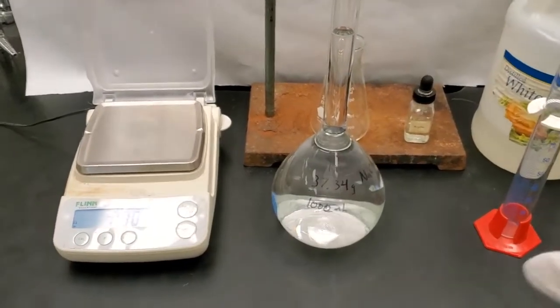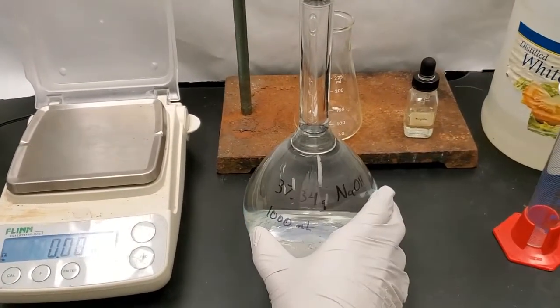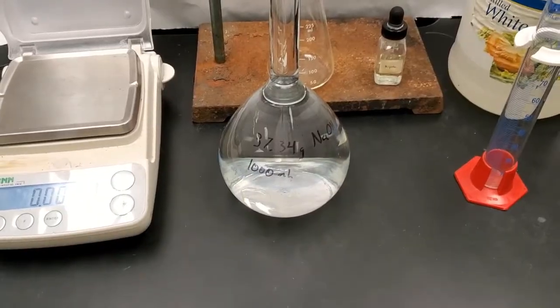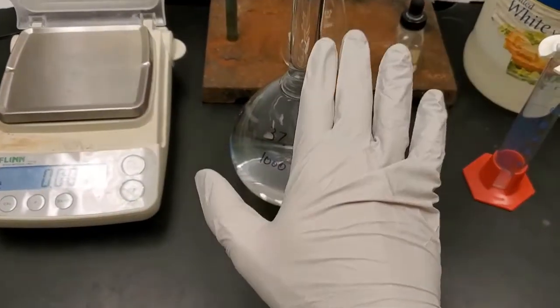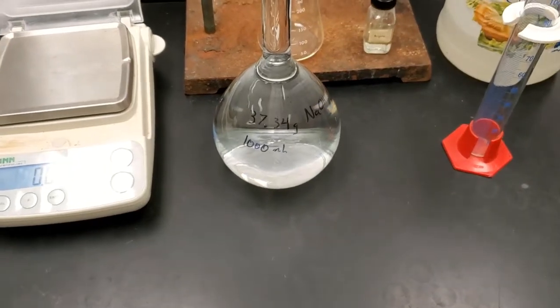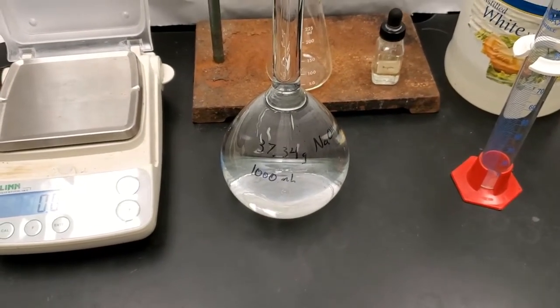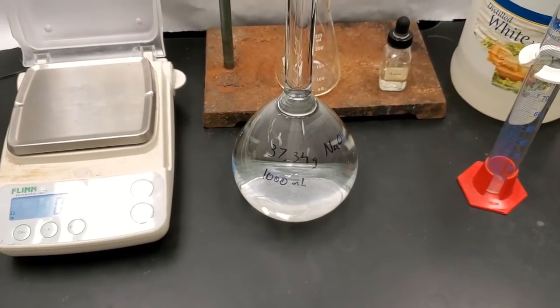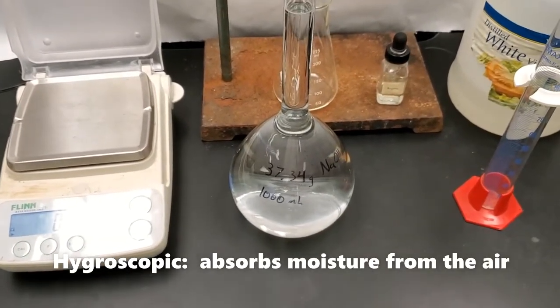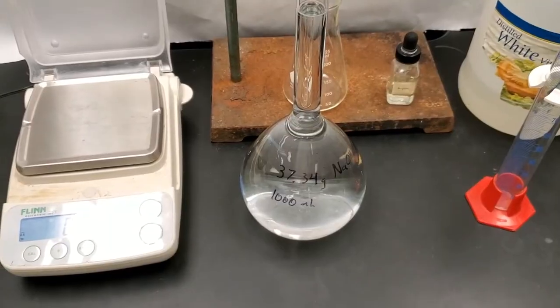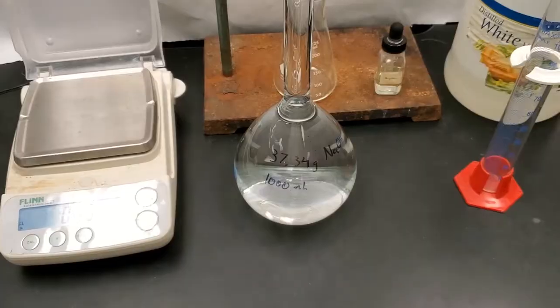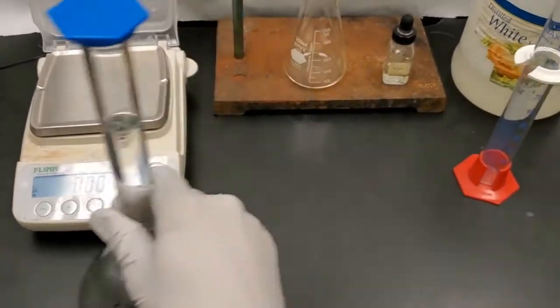Alrighty. So now we have our standard solution. We are going to call this our titrant. It's what we are going to do the titration with. And if you'll notice, I'm wearing gloves now because sodium hydroxide is a base. And even though this is a fairly small concentration, it can still be hygroscopic, which means it absorbs water. And it can be caustic, which means it can eat away at the skin a little bit. So wearing gloves as a safety measure. So we're going to put that to the side for now.